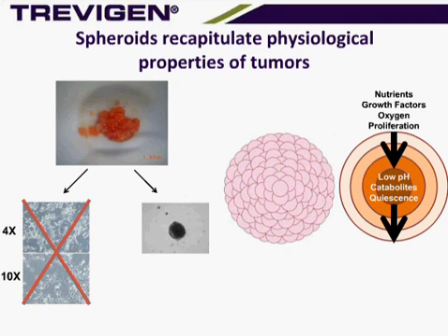It's just showing how these are diffusing out, and as a result, we get heterogeneous cell populations where the cells in the core, in this very toxic environment, actually become necrotic or apoptotic. You see cell death.